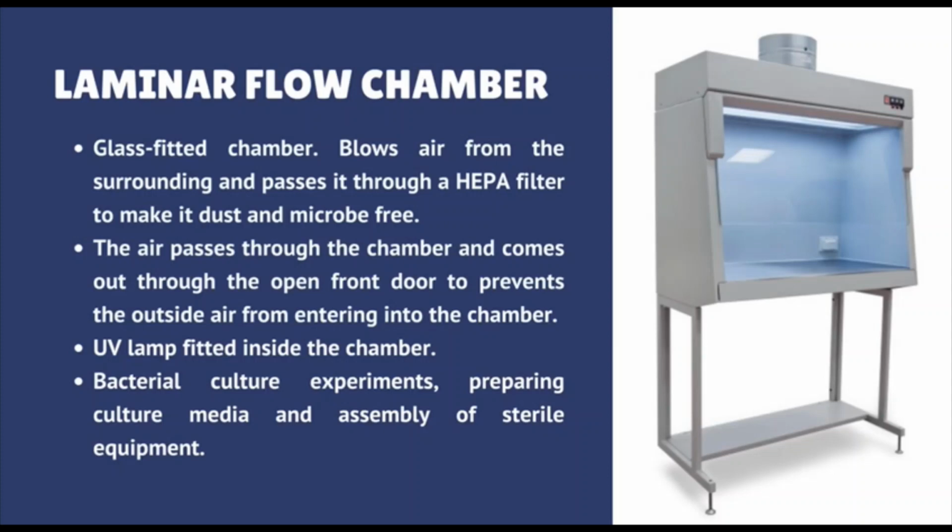Also, there is a UV lamp fitted inside the chamber to sterilize the chamber before operation. Since the laminar flow chamber blows air back to the area of the worker, it cannot be used to handle infectious agents, but it can be used for bacterial culture experiments, preparing culture media, and assembling of sterile equipment.